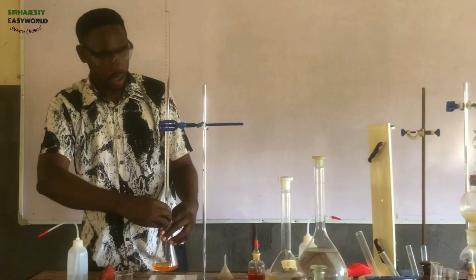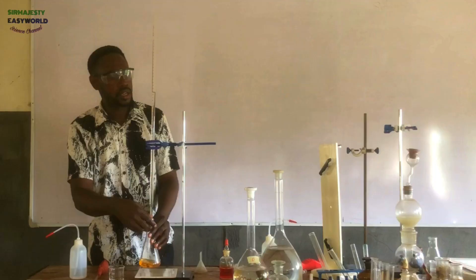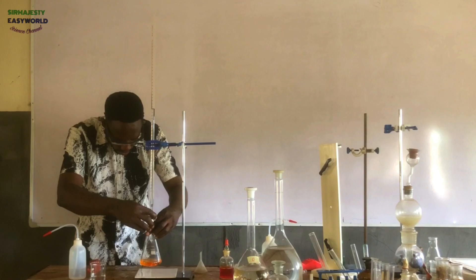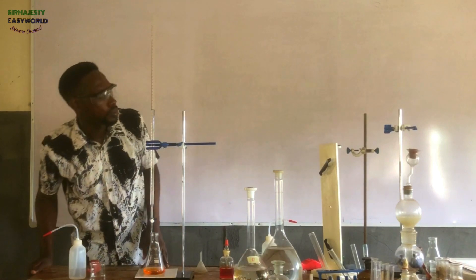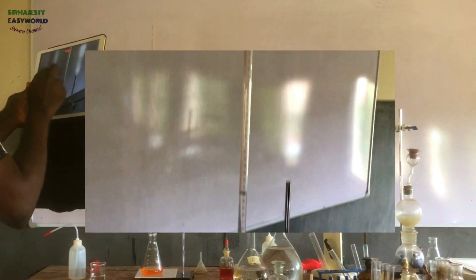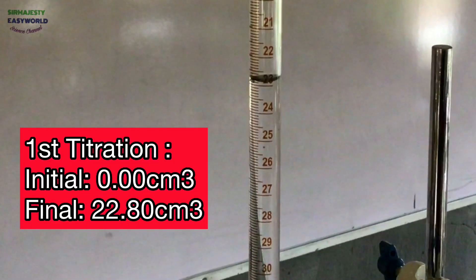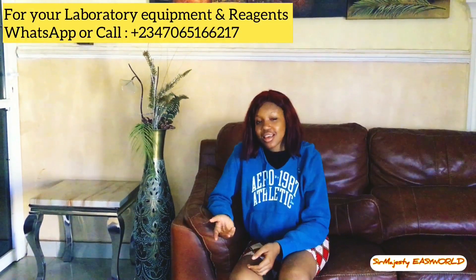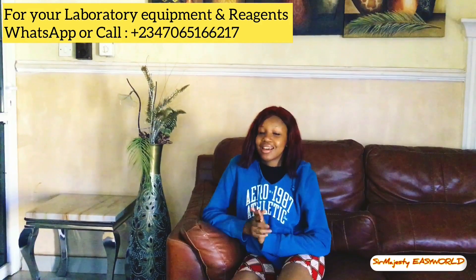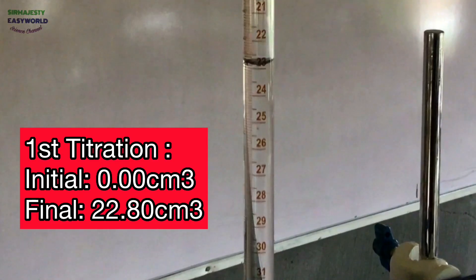So next, we continue. The first titration: I just opened the tap because I have done the rough titration which gave me 22. So while shaking the mixture, when it's up to 10, I just opened it until it's 19, then I gradually start tracing the endpoint. And there — very soon, I'll be there. That's the endpoint. Let's look at it from the closer camera. This is 22.80.